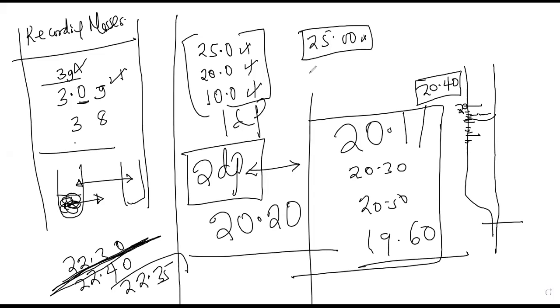Okay. The initial burette reading may be either the same or different, but we don't like it being the same because we are asking ourselves, aren't your solutions reducing? Because your specification is always clear.